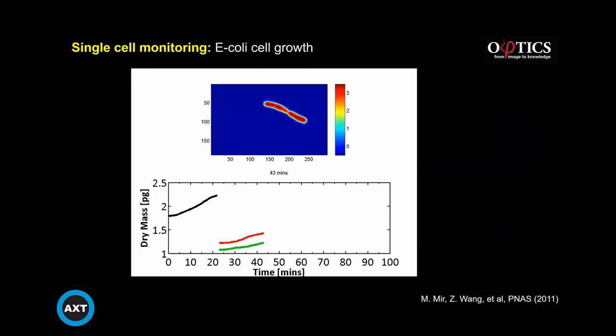You can start by monitoring, for example, the growth of single cells. In this case, for example, E. coli.